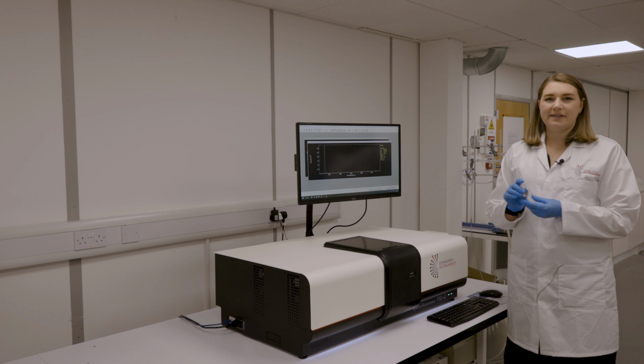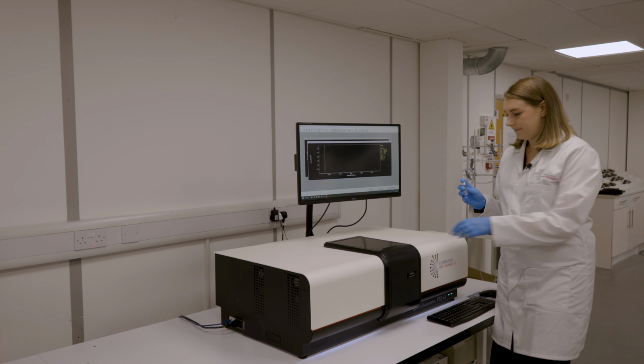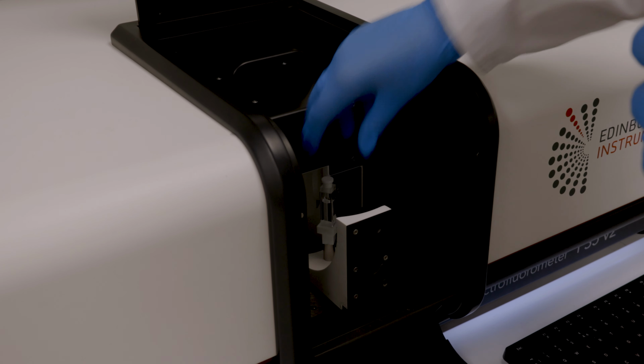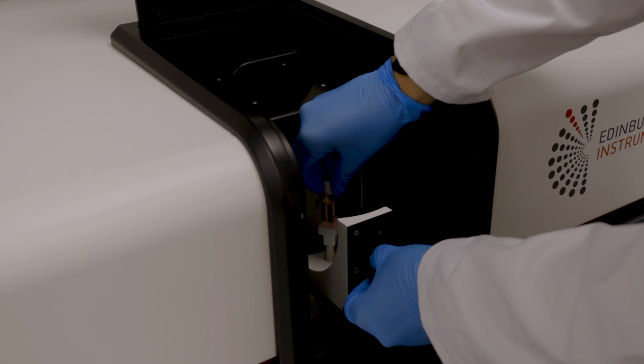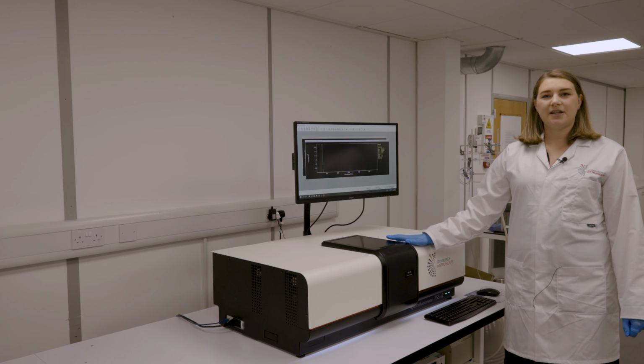Now we swap our blank for our sample. This must be the same volume in an identical quartz cuvette. We now run the measurement for the sample.